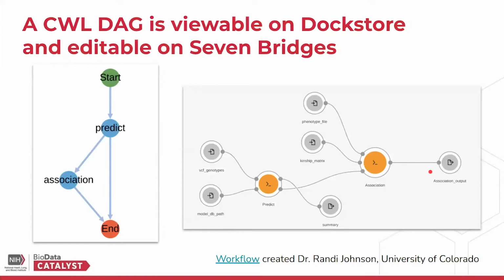And I'm going to be focusing on Common Workflow Language, or CWL. Now, that said, there are other workflow specifications that Ash already mentioned, such as WDL and Nextflow, both of which can now be run on BioData Catalyst powered by Seven Bridges in an early access manner. So if you do want to test this feature out, please email Tony or myself, and we can give you a specific flag on your user ID to be able to test that. But that said, I'm going to talk about CWL right now.